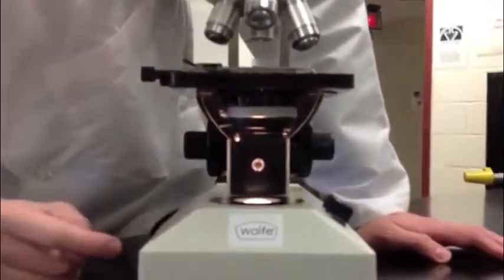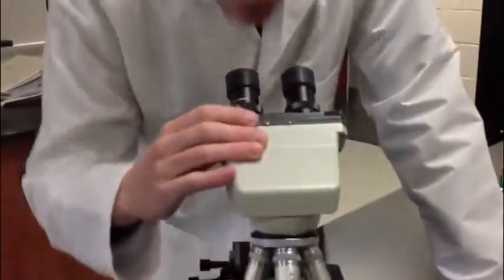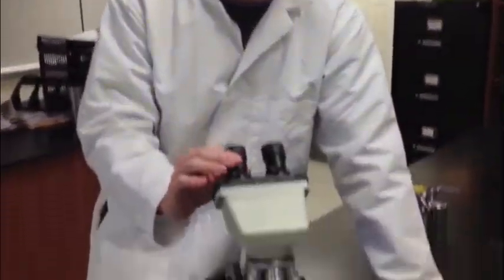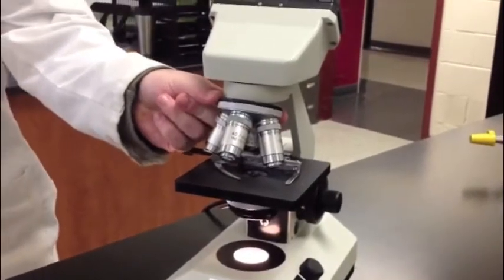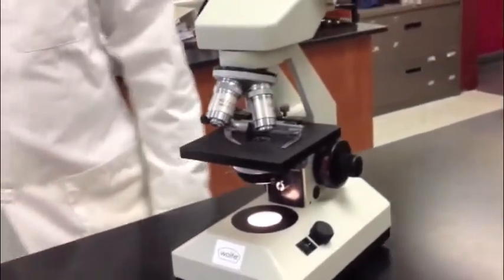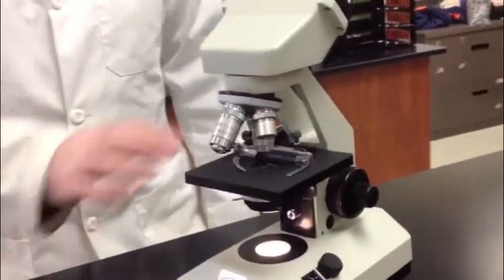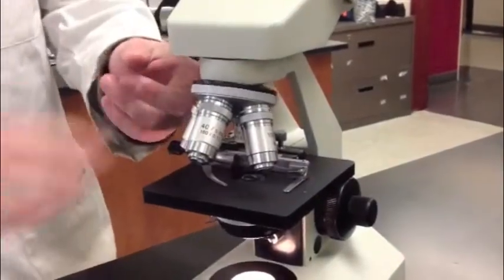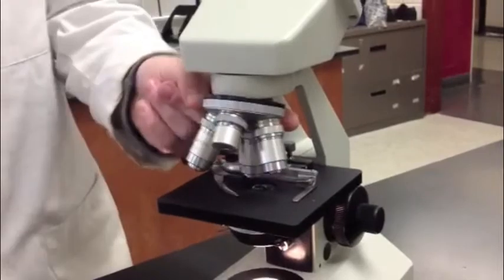It moves back and forth. Light again comes up through the objectives, which we'll come back to, and you look through the eyepiece here, which contains the ocular lens. This piece right here is called the revolving nose piece. It contains the objective lenses, which actually magnify your object. When you want the objective lenses in place, they actually lock and click a little bit so they're able to view. We have four objective lenses on our microscope. The smallest one, which is right here, is a 4x lens, and it's called the scanning lens.